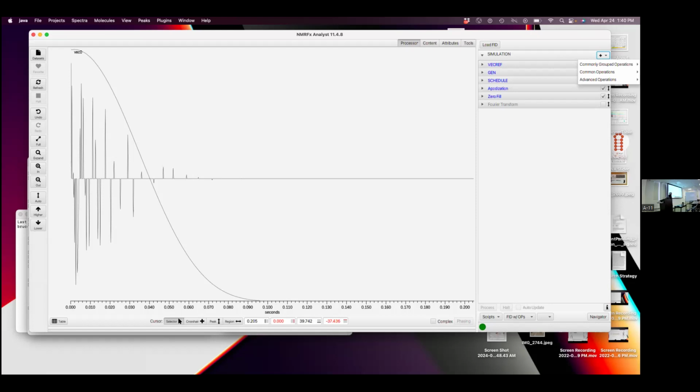There are many different ways, when doing an experiment, to decide what points to measure and what points not to measure. I'm just specifying a certain fraction, and what I'm defaulting to in here is something called Poisson gap sampling. And you can see just looking here, there are more points that are measured near the start of the signal than there are measured out here. And that's a property of Poisson gap sampling. Depending on what reconstruction algorithm you use, you can have better or worse choices of what the sampling schedule would be, but Poisson gap is probably the most widely used.